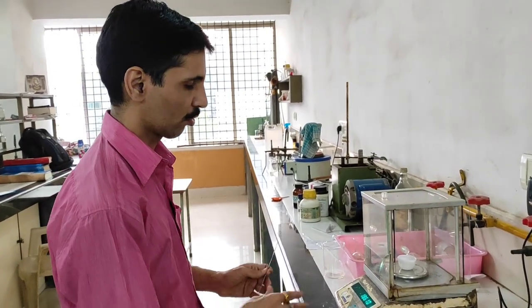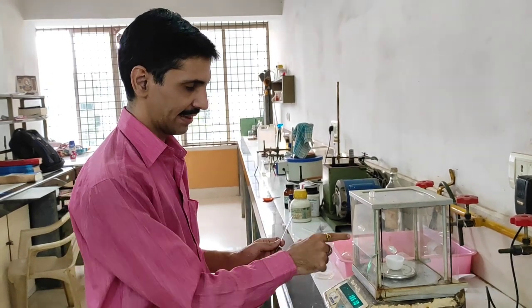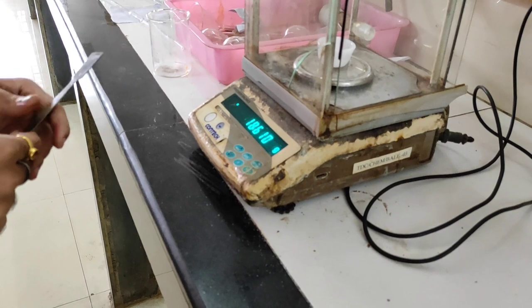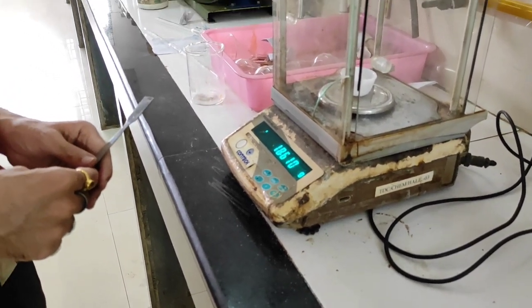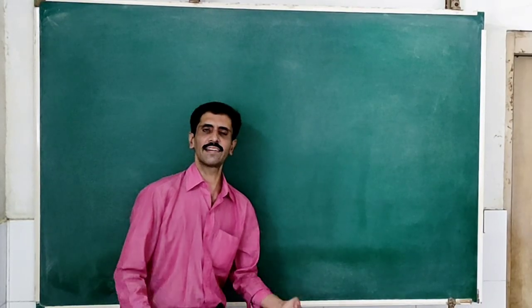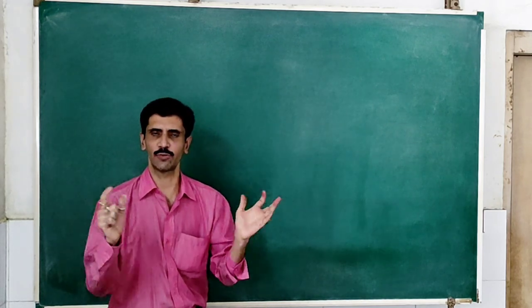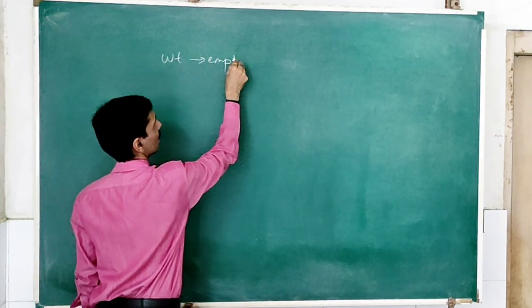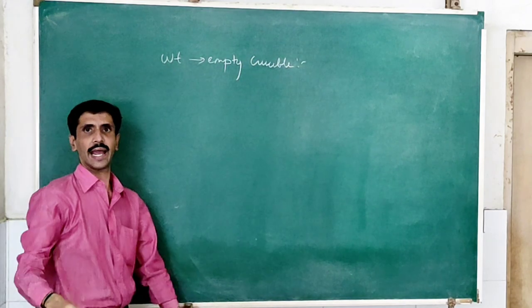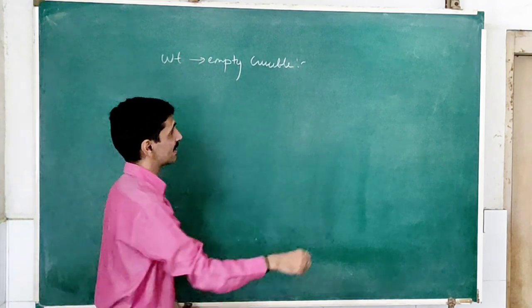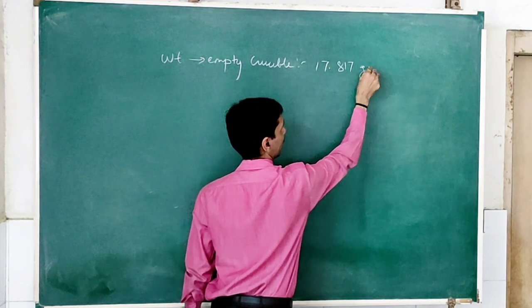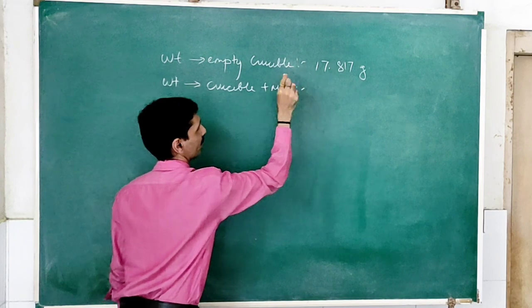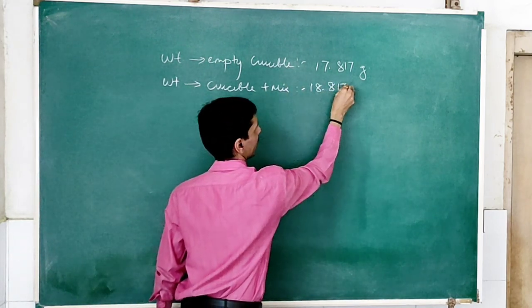Now we go for the final weighing. The crucible has been cooled through the asbestos sheet as well as the desiccator. You can see the crucible is now on the weighing balance and it is 18.610 grams — this is the weight after the entire process of heating and cooling. The weight of the empty crucible was 17.817 grams, and the weight of the crucible plus the mixture before heating was 18.817 grams.